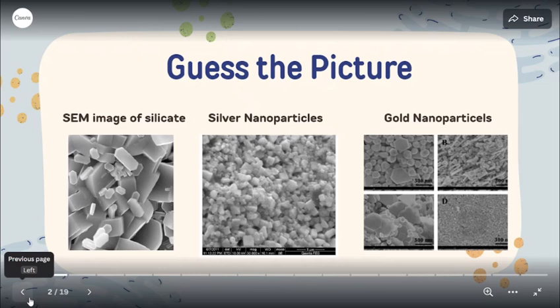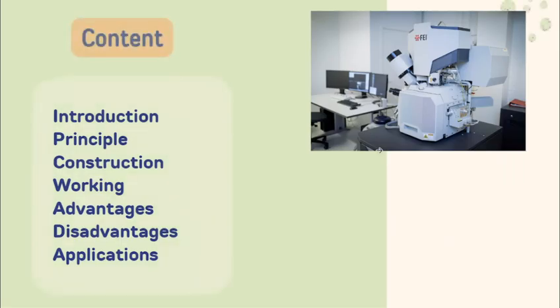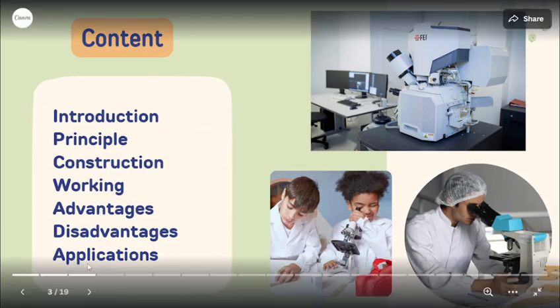Can anyone guess this picture? Yes, this is the three-dimensional SEM image of silicate, silver nanoparticles and gold nanoparticles. The contents of the session are introduction, principle, construction, working, advantages, disadvantages and applications.